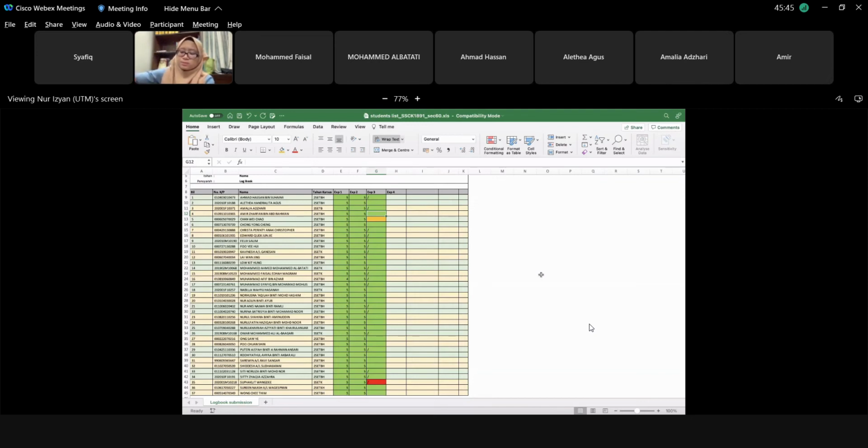Amir? Can you remember the type of brand of the AAS available in the lab just now? Cannot remember.